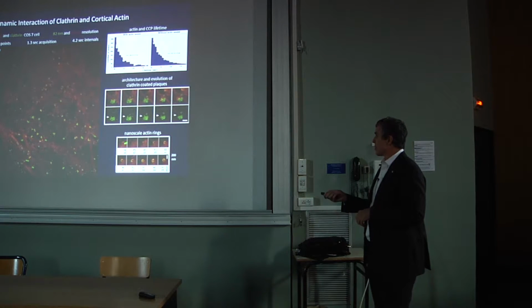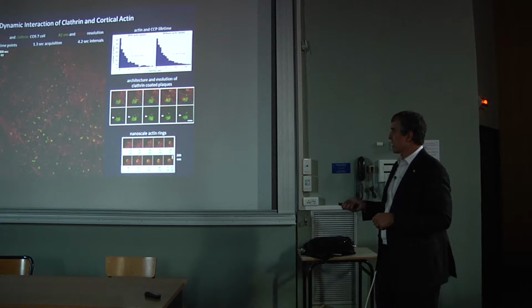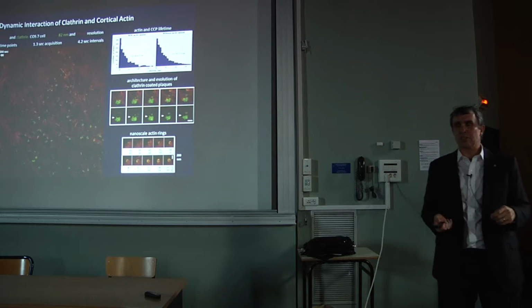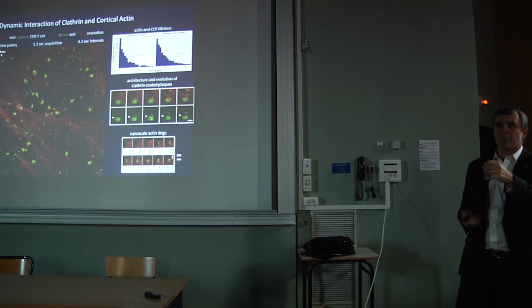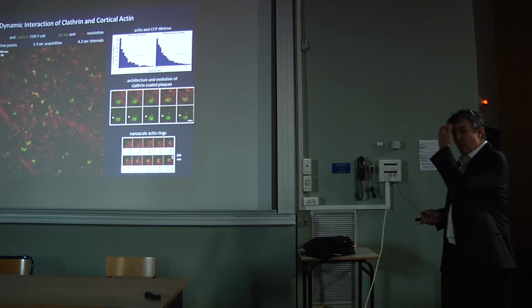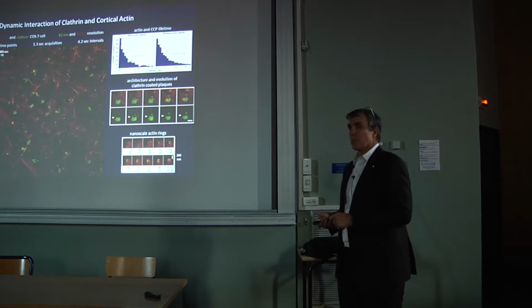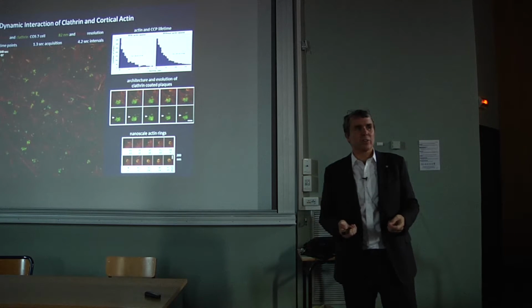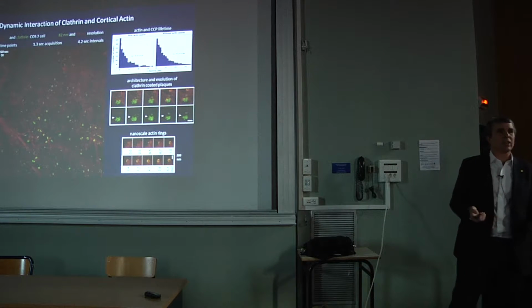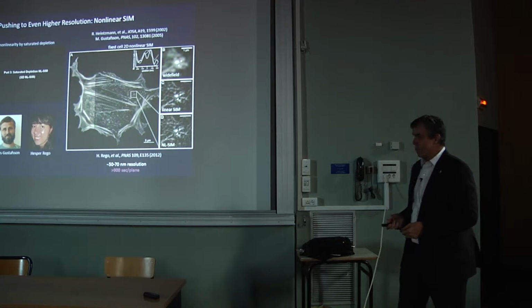pits from them. We also found, to our surprise, that there were actually tiny rings of actin, like the rings of clathrin. And we thought initially that these would be co-localized and being used to help internalize the pits with their forces. But it turns out that almost none of them are co-localized. And so, you know, there's not a lot of description of these small actin nanoscale rings in the EM literature. And so we're really not quite sure what they are or what their role is.